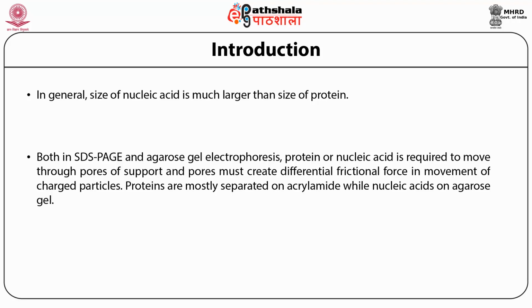Protein or nucleic acid is required to move through pores of support, and pores must create differential frictional force in movement of charged particles. This is the reason why proteins are mostly separated on acrylamide gel while nucleic acids on agarose gel.